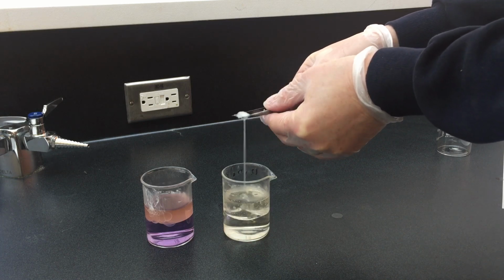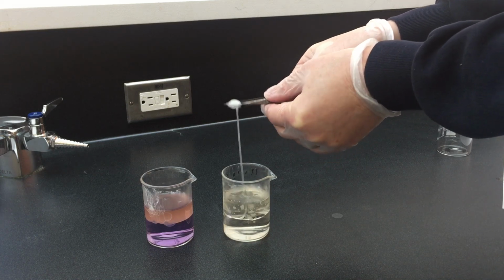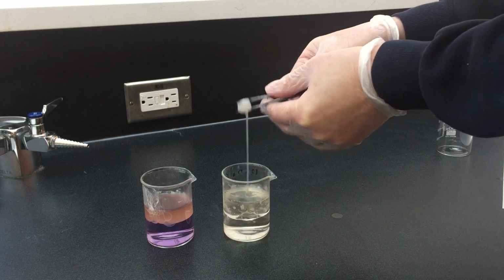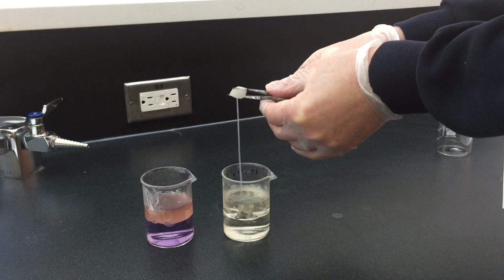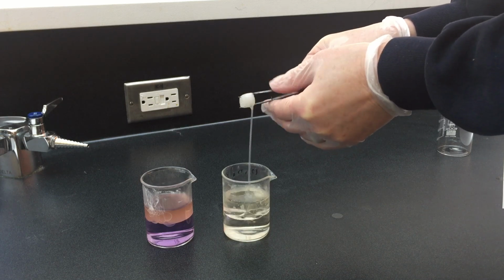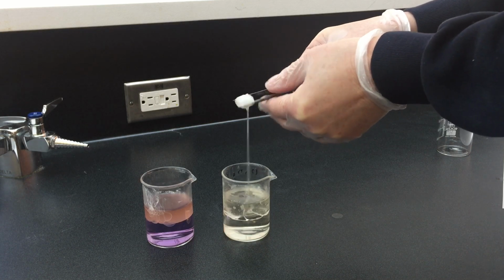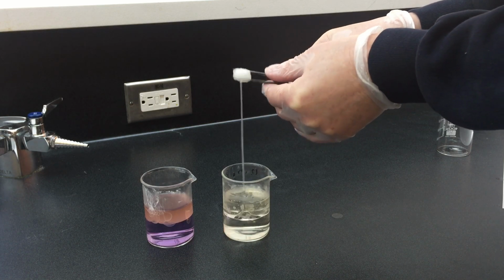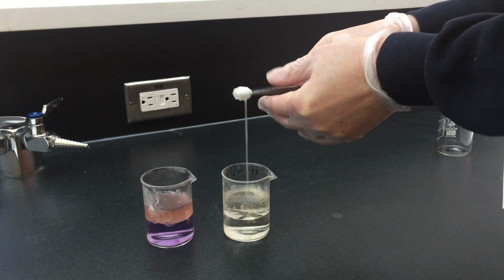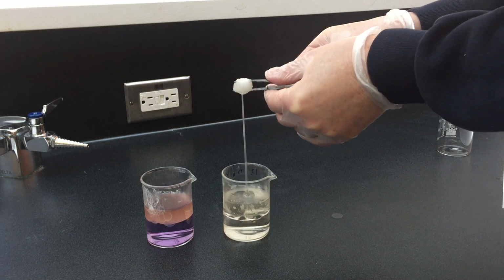And you can see the reaction is only taking place at the interface between the aqueous and the organic layer. As I slowly pull the fiber out, the reaction continues and we get a continuous fiber. And so we are making the textile nylon. Even from a very, very small amount of diamine and diacid, we can get a substantial amount of nylon fiber wrapped around my tweezers.